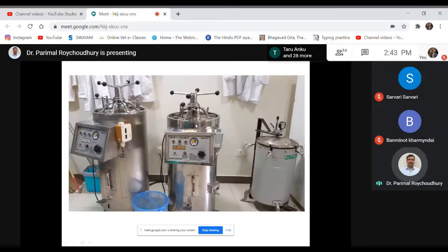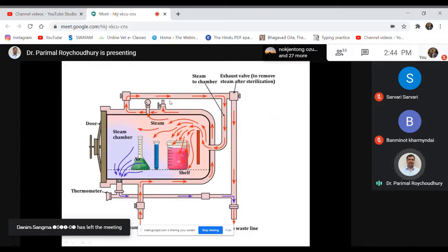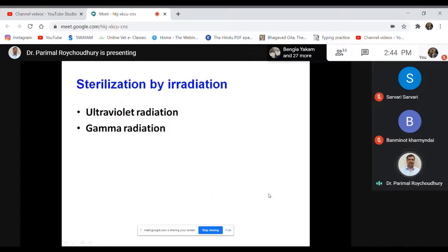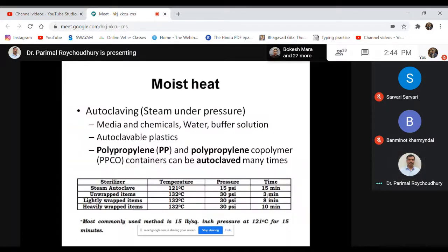Okay, this particular model, we call it a vertical autoclave because its orientation is in a vertical position. There is another, what we call a horizontal autoclave. In the public health department, they have a horizontal one. We don't have a horizontal one in our lab. Only the orientation is different, which is attached with an already preheated steam chamber, and we can release the steam and put the items here. So once the pressure attains 121 degrees centigrade, we can maintain it for 15 minutes, and that will serve the purpose of autoclaving. So these are the two most common methods that we use in microbiological work.